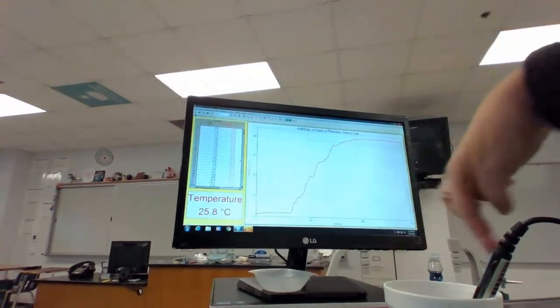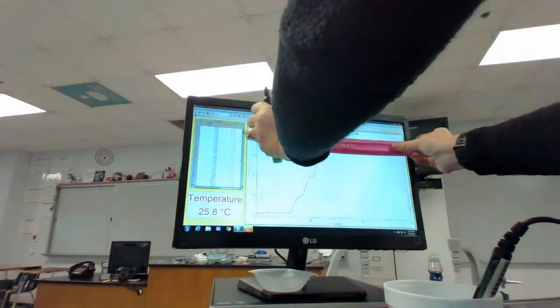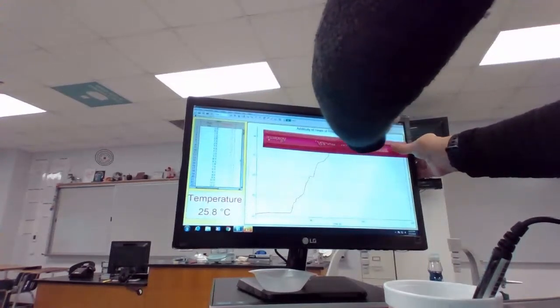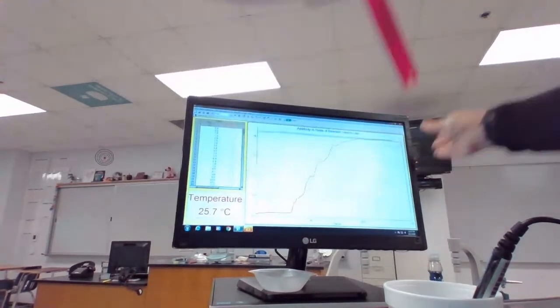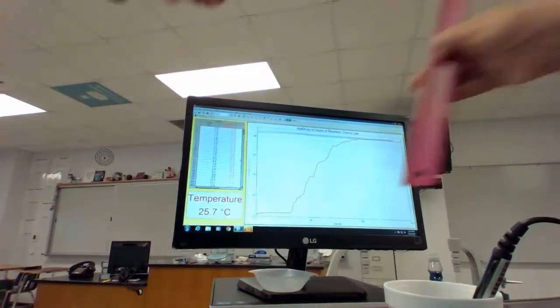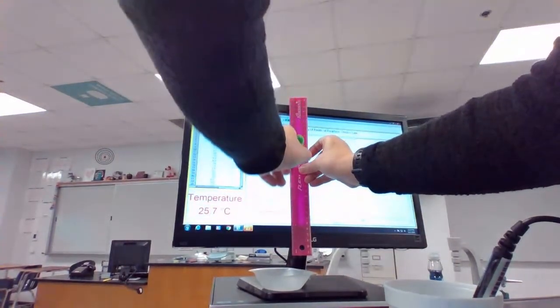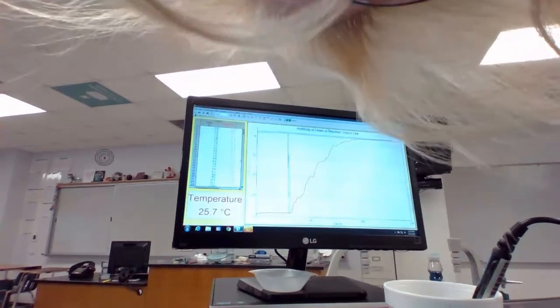Because as you know, the top of our cup is open, and so the way we determine if we've lost any heat to the outside air is we use our graph and we draw a line that is adjacent to the top line here. And I'm going to draw it across to where it crosses there. And then this one, okay, so I draw myself a little T on here so that you can possibly see that too, yes?